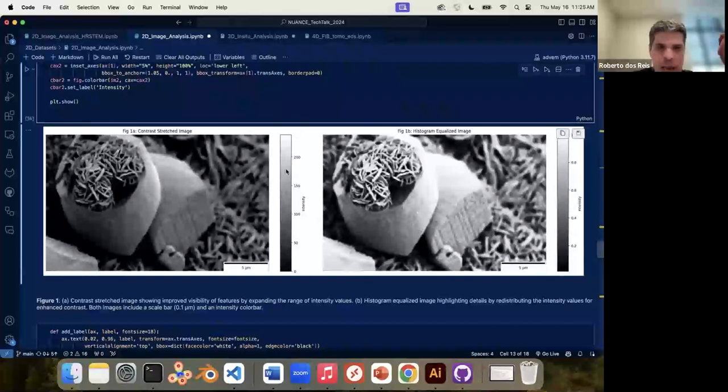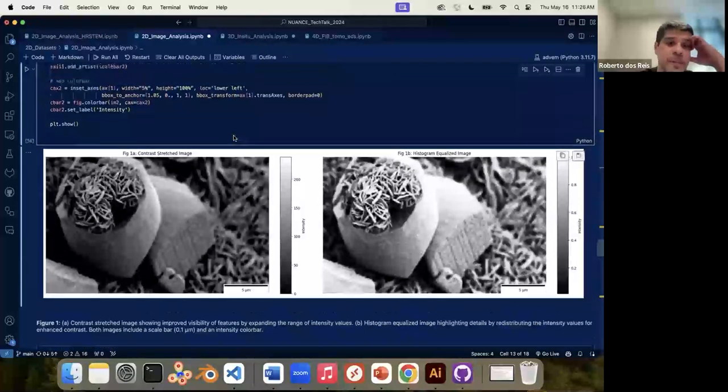important. And in some cases, which I actually like to do, is plot the intensity, especially when you're comparing data, right? Say you collect the data today and you collect the data from the same sample tomorrow, you might have the same parameters in the microscope, but the microscope might be behaving a little bit differently in a way that you have some unbalanced contrast. Very minor, might be important if you want to do quantification in a sample.